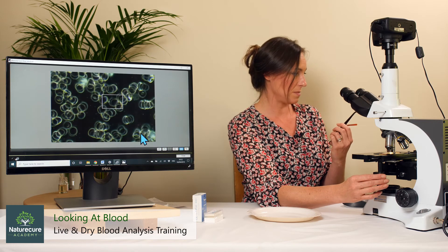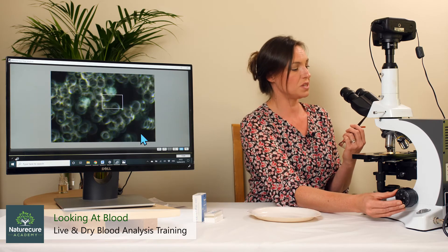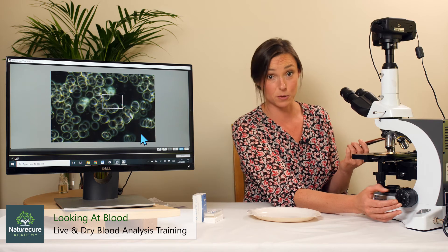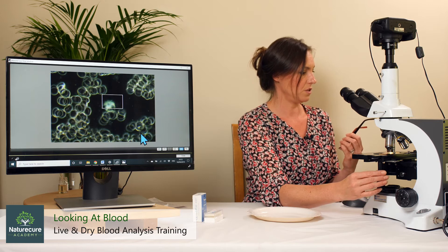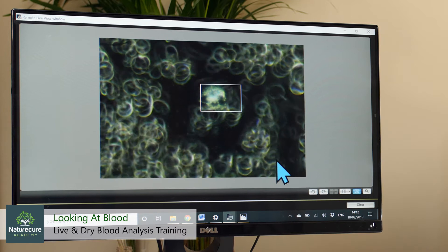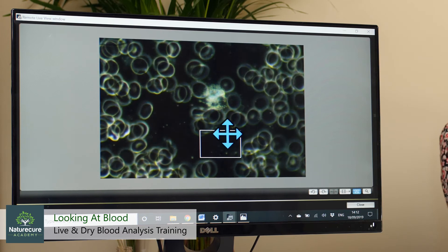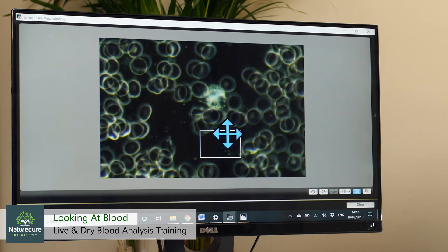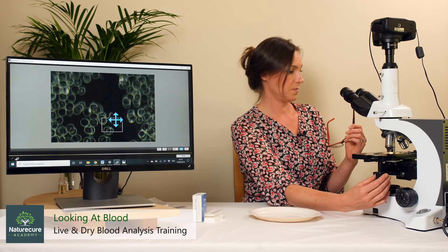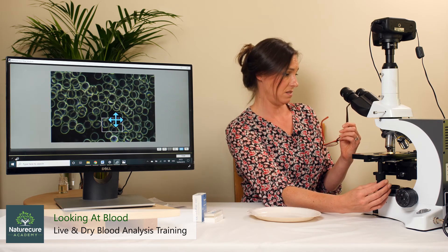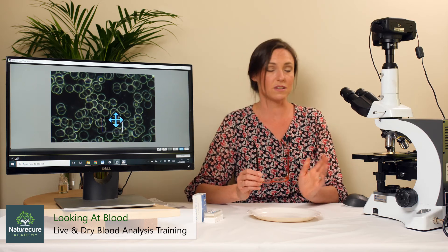Lots of red blood cells as you would imagine. There are some more small fuzzy white blood cells. You can see why white blood cells get called white blood cells — under the microscope they glow white. There's another one. There — you can see a pulse that can sometimes happen: a pulse of something goes through the blood, moves things around, and separates the blood cells a little bit so you can see them more individually.